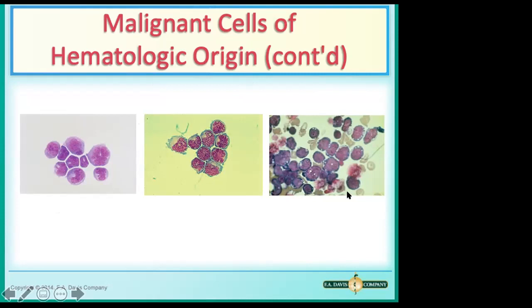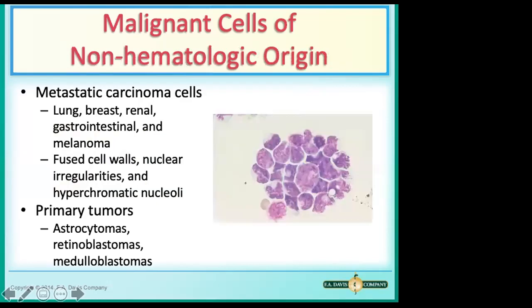These are again big, abnormal looking cells, but the only difference is that they have true vacuoles. These vacuoles didn't happen because of the centrifugation. They happen because that's Burkitt's lymphoma. That's the way that it looks.